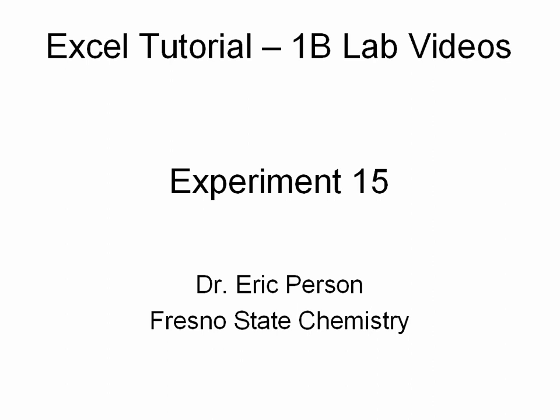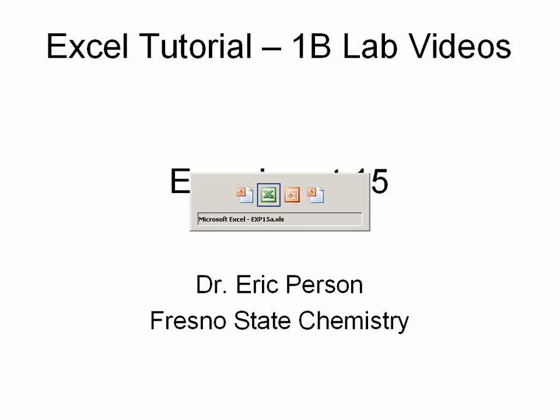Hello, in this Excel tutorial video for Chem 1B, we'll be looking at the data analysis for experiment 15.